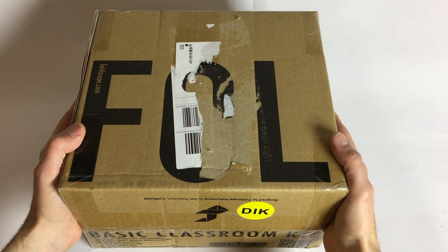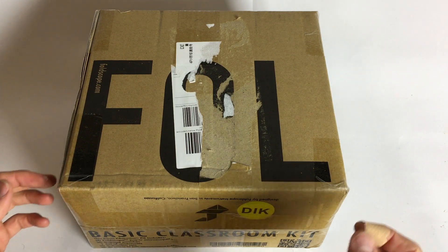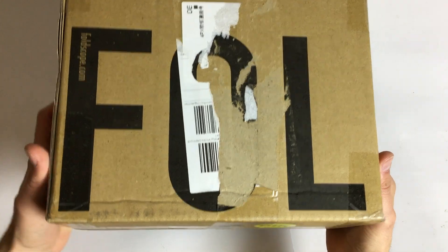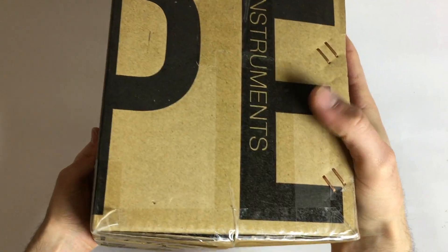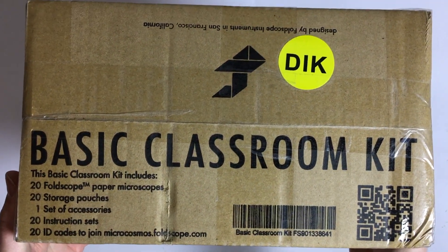Today we got a 'Trit Especiale' — I don't know where I heard it but I think that's what you say if you unbox something today. And if we have a look at it, it is the F-O-L-D-S-C-O-P-E instrument. The Foldscope basic classroom kit.